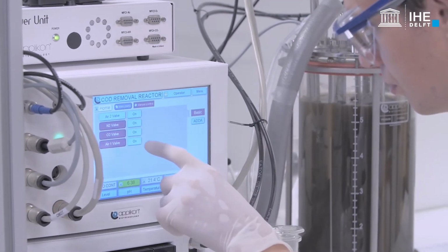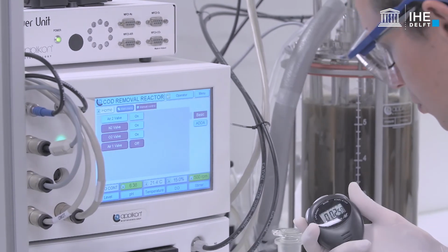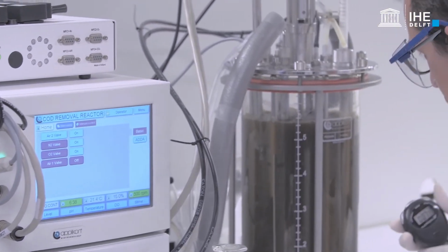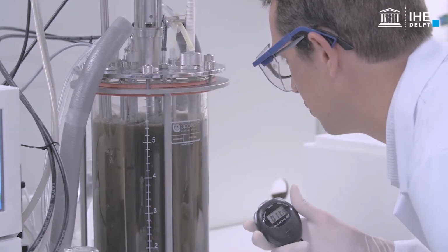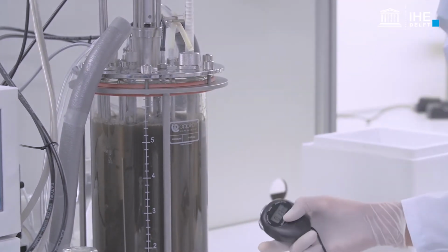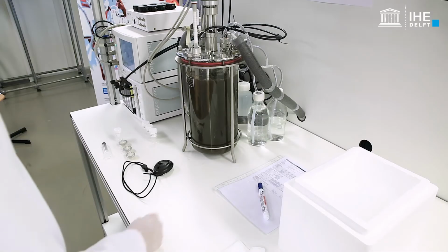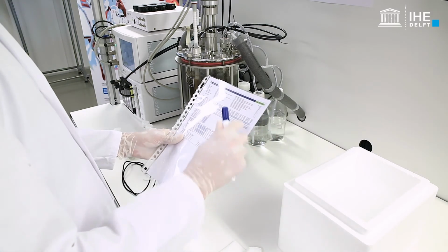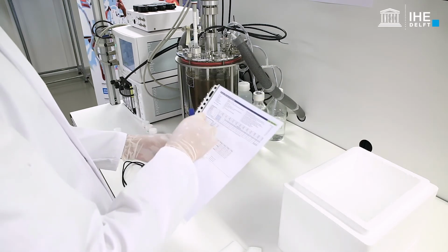Start the aeration and aerate the sludge sample for 30 minutes. To aerate the sample will help to remove any residual biodegradable organics. After aerating the sludge sample for 30 minutes, continue with the next steps of the test.